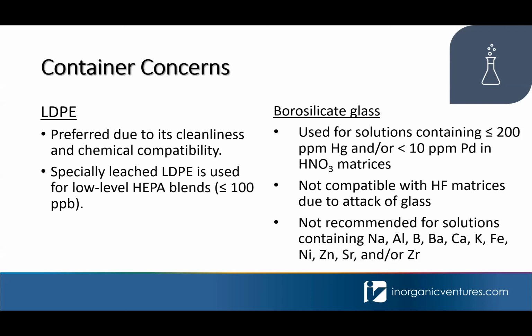So without the use of borosilicate glass, what happens is you get an adsorption of the mercury or the palladium onto the surface of your plastic container. And the use of borosilicate glass prevents this adsorption phenomenon.